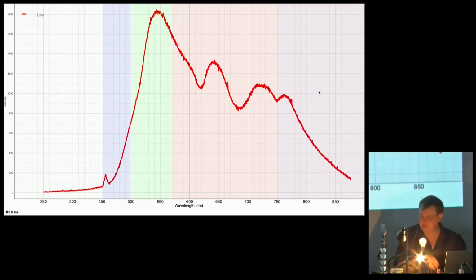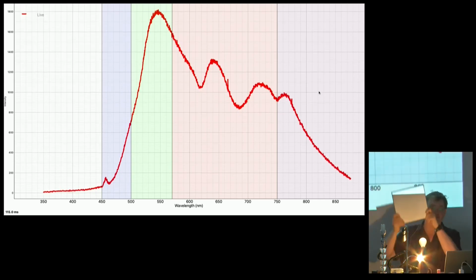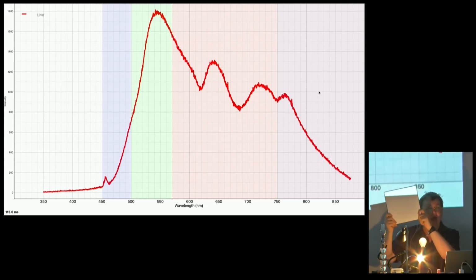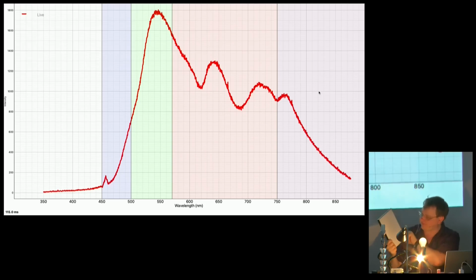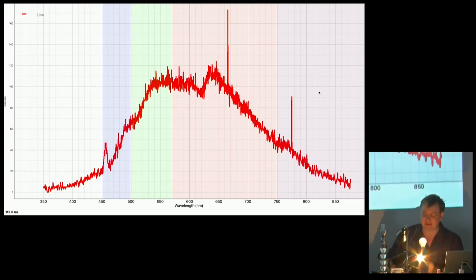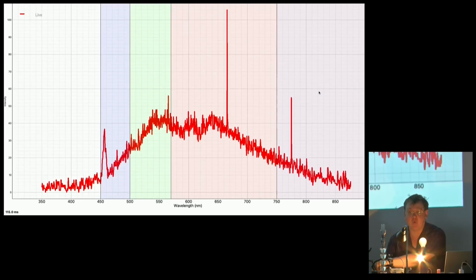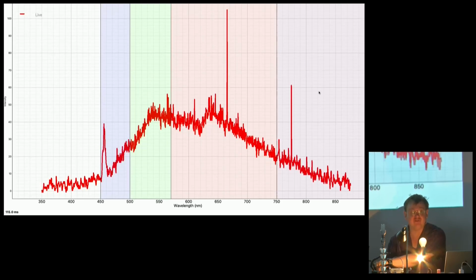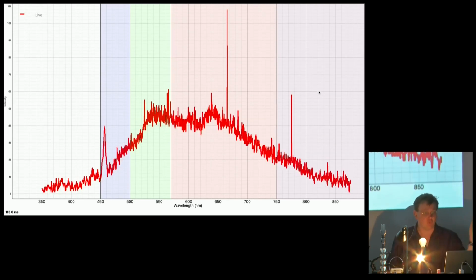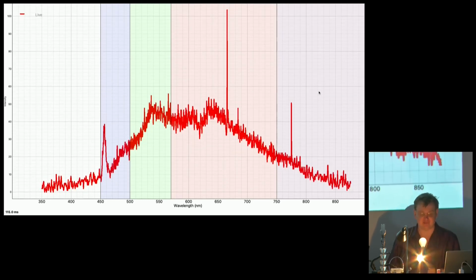And this is where you bring in a very expensive piece of white plastic. This is a very expensive piece of white plastic. By very expensive, I mean multiple thousands of pounds. It's a Spectralon panel. This is a slightly damaged one, hence why I've brought it to a field. And it's basically really reflective in almost all wavelengths and reflects uniformly across wavelengths. So basically, it's pretty much perfectly reflective in all the different wavelengths and from all the different angles, and it's meant to stay stable over time.